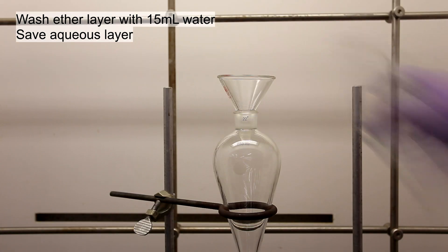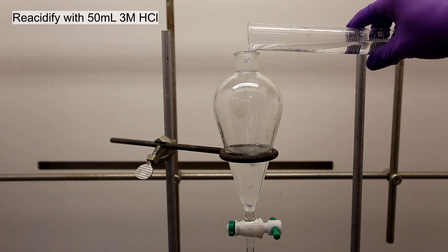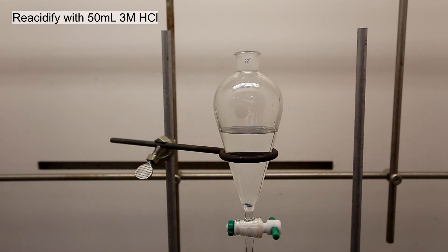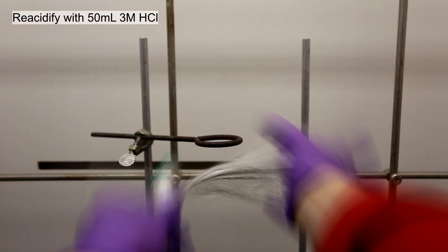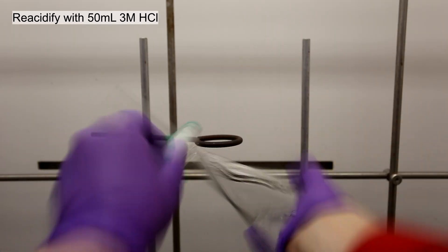The aqueous layers are then added back to the separatory funnel and re-acidified using 50 milliliters of 3 molar hydrochloric acid. This regenerates the ether-soluble butyric acid.